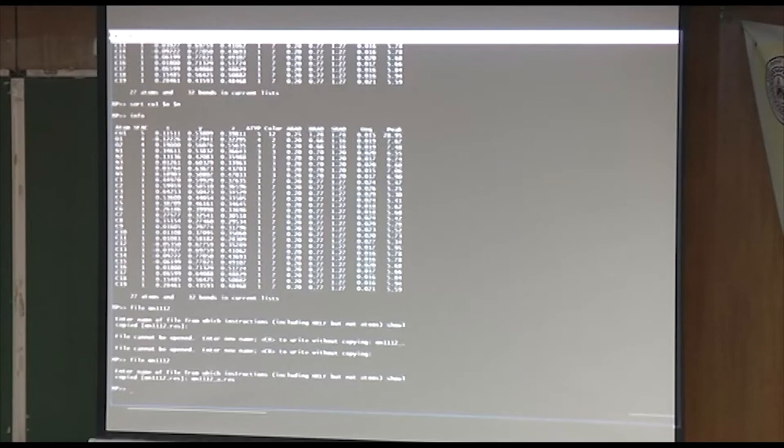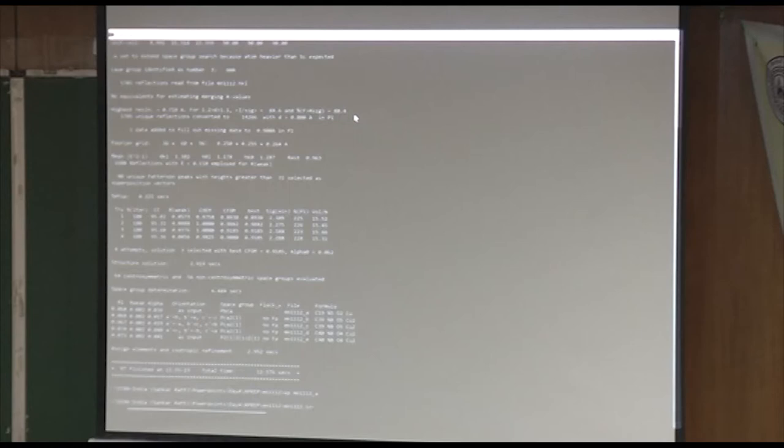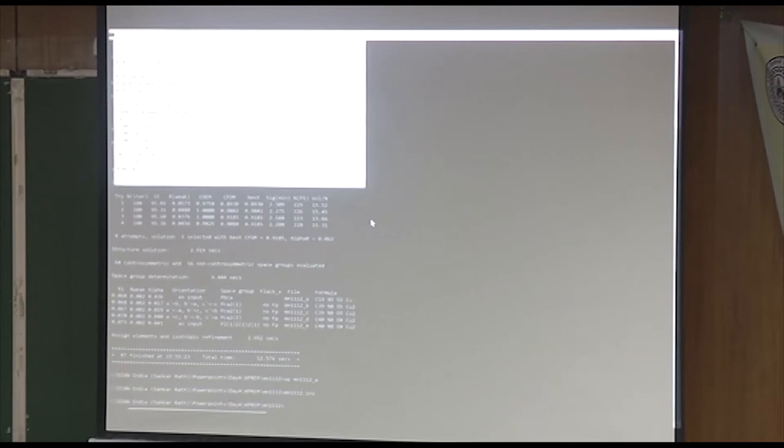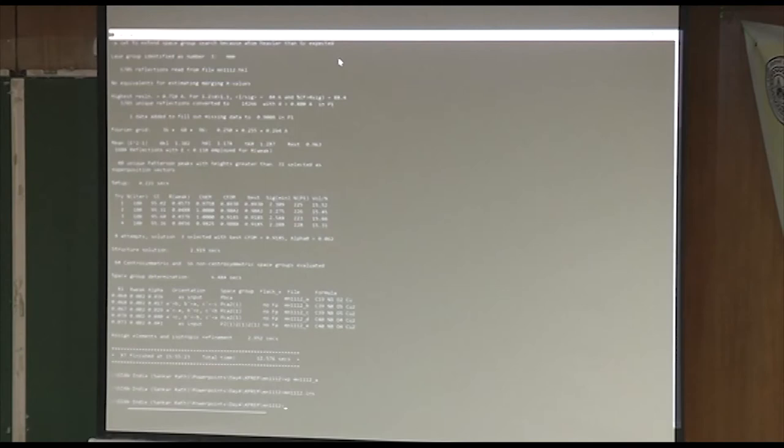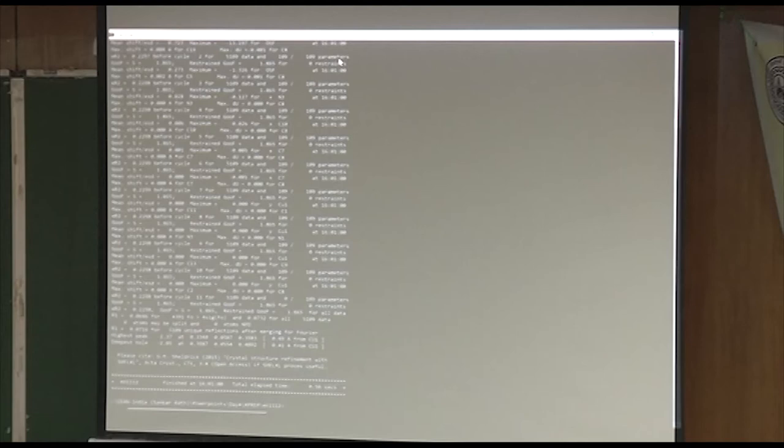Let me show you what the INS file looks like now. It's just what it was before, except it has added LS 10, BOND $H, LIST 6, FMAP 2, and PLAN 20. So FMAP 2 means calculate difference map, PLAN 20 says give me the top 20 peaks. You see this FVAR, that's that scale I was telling you about. This number starts out as one, but it's going to vary as we do a refinement. I just do XL and then the file name.